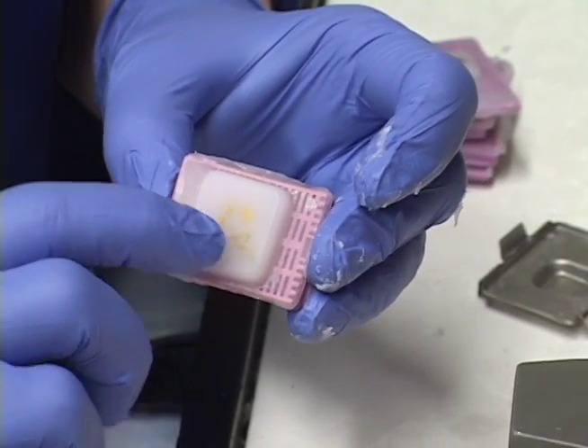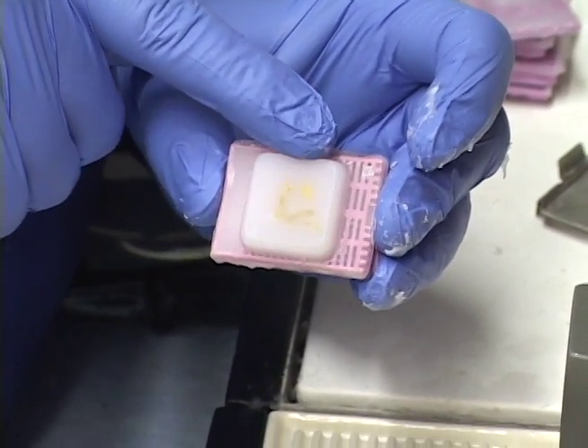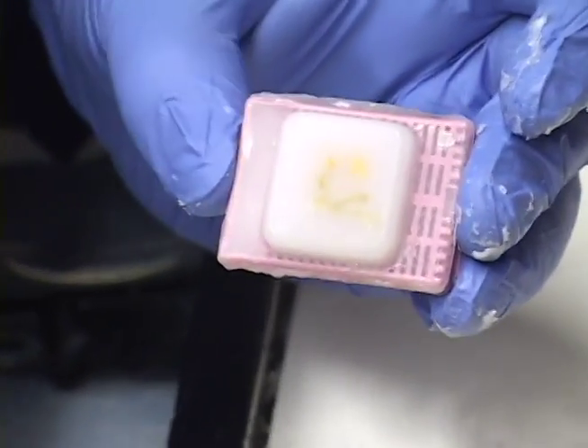This is the testes with the epididymis block we just embedded. You can see it's nicely evenly embedded — all at the same level in the paraffin block. Here's the epididymis, here's your longitudinal section, and there would be your cross section.